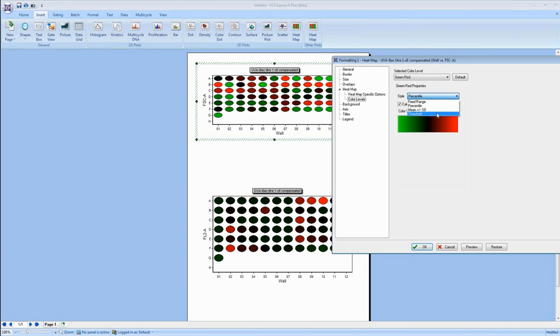And the last one here is threshold. I'm going to come back to threshold in a minute because there's a few things we can do with that. But I also wanted to mention all the different color levels that we have as well. So not just the style or the scalings, how we want to display different colors.